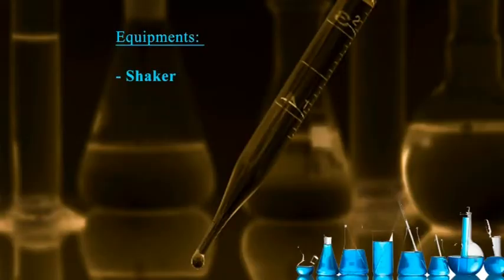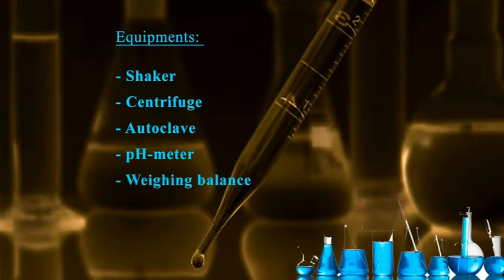The major equipment required for this experimentation include shaker, centrifuge, autoclave, pH meter, weighing balance and laminar airflow.